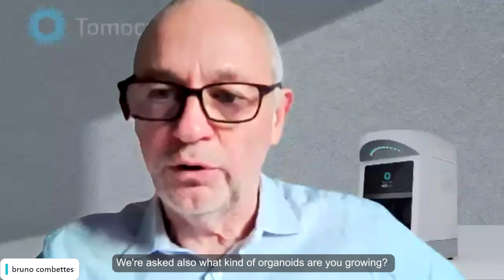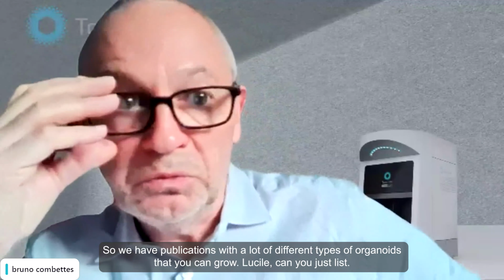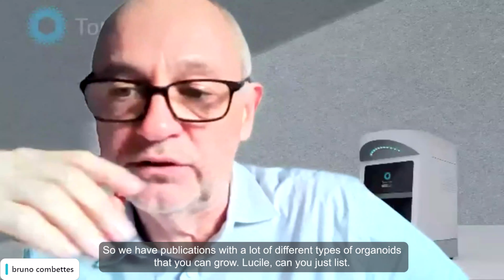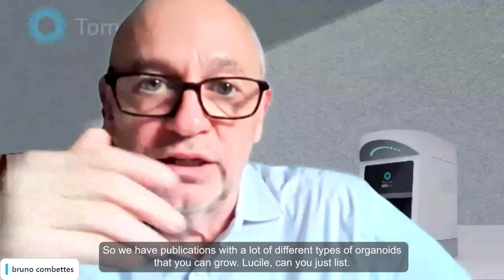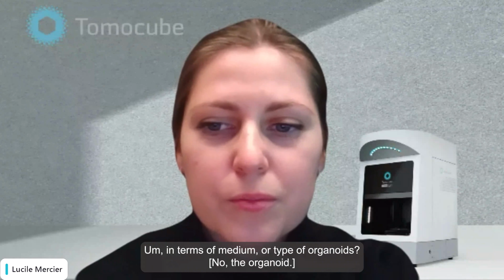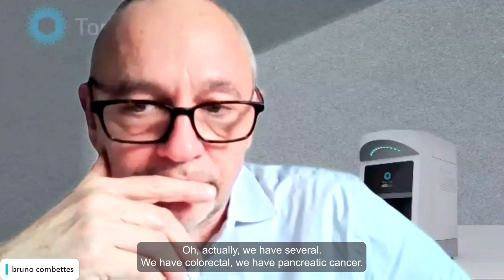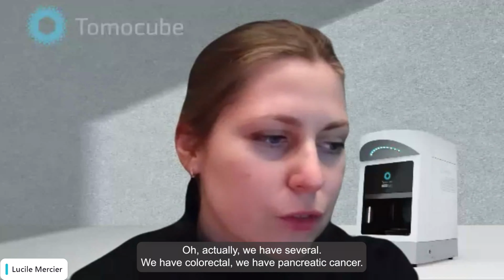We ask also what kind of organoids are you growing? So we have publications with a lot of different types of organoids that you can grow. Lucile, can you just list the different types you've done? In terms of medium or type of organoid? No, of organs. Actually, we have several.